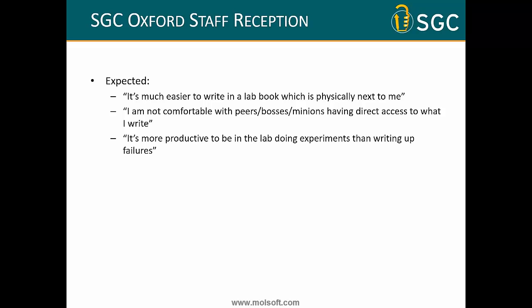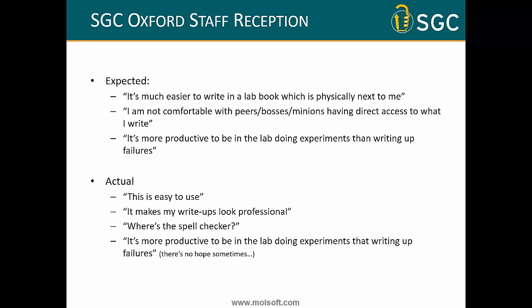We expected them to say, well, we're used to writing up in a lab notebook, which is physically next to me. I don't really want people around me to see what I'm writing when I've not quite finished it, and I'd rather be in the lab doing experiments rather than writing up many failures. But what we got was this.